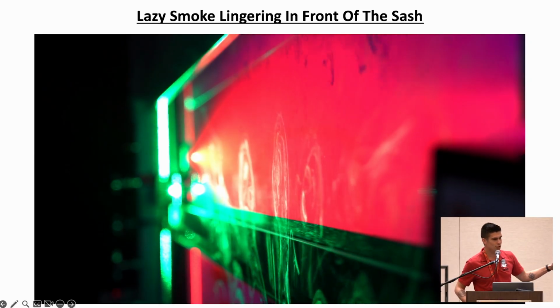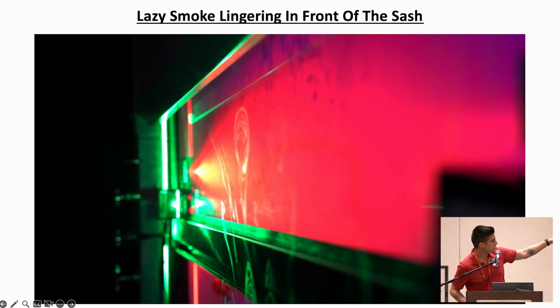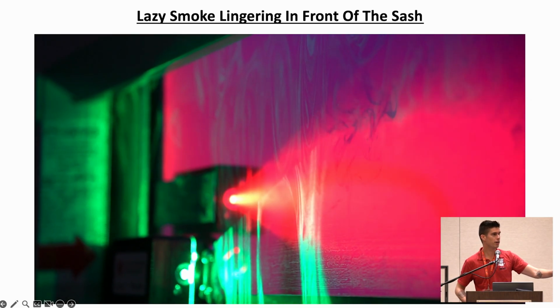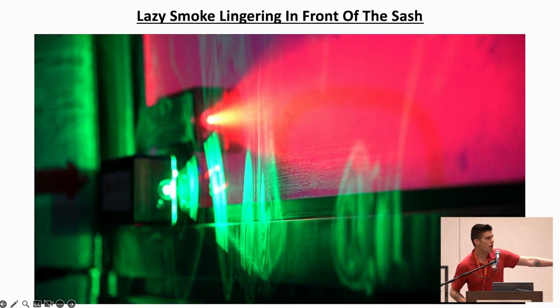And look at that lazy smoke dangling and sinking right in the sash. You can see the gap between the sash and the front, and it's literally going at it. The hood is sucking it back into the sash, that's great. But that's exactly where my nose is.